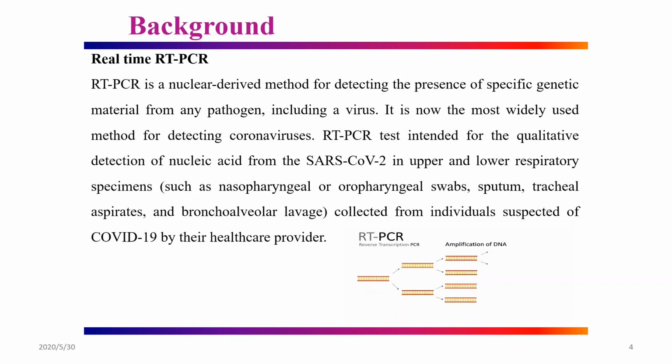If we repeat several different cycles, we can generate multiple fragments of DNA out of one. If one DNA fragment serves as a template, in the second cycle we have already 2 DNA fragments, and in the third cycle we already have 4, and so on and so forth. If you want to know more about the PCR step, I made a video about that, which I just put in the video description. So you can watch the video where I talk about PCR in more detail later.